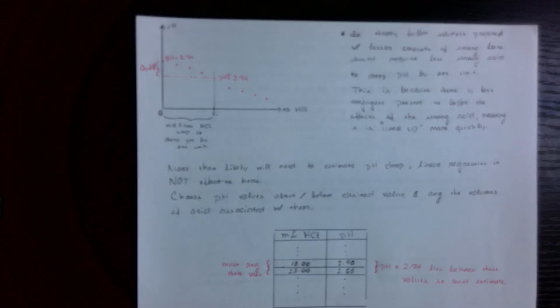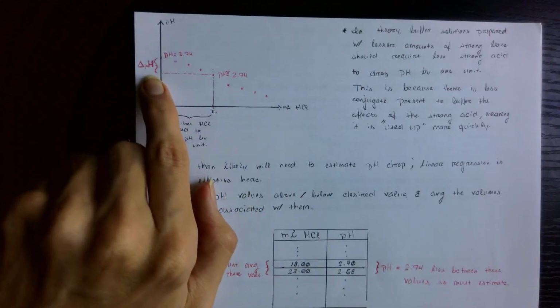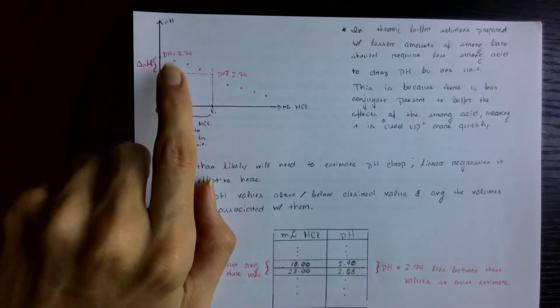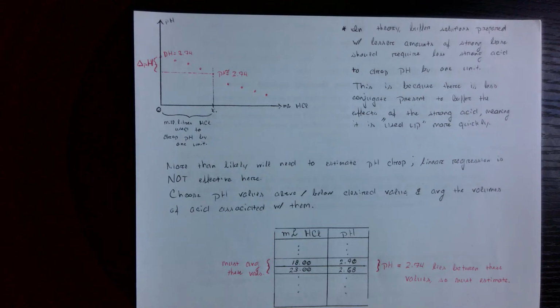The second sheet, which is titled Analysis, is where you're actually going to make some charts or scatter plots. What you're basically doing is, if you had been in the lab, you would have taken your buffers after you prepared them and titrated them with hydrochloric acid. Using a burette tells you how much acid you've added, and you would use a pH meter to track how the pH of the buffer changes as you add strong acid to it. In theory, as I said, for each successive buffer solution, you use less strong base. That means there's less conjugate base present in your buffer.